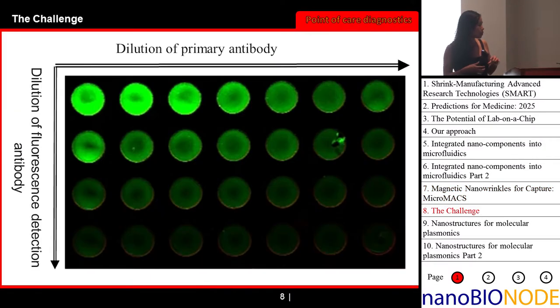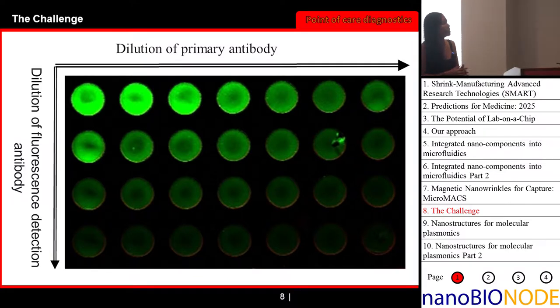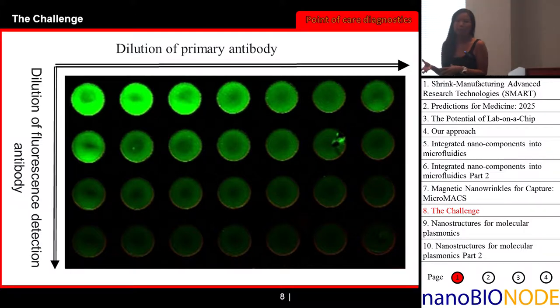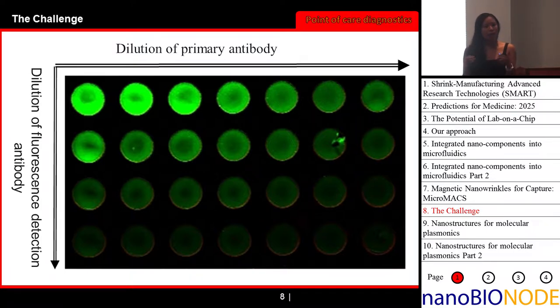The larger question that we've really been tackling over the last several years is, when you go out to the field, how do we bring the detection capabilities that we have in the laboratory to the field? This field of lab on a chip, my chair of my department, Professor Abley, who's also a lab on a chip person, says we call it lab on a chip, but right now it's more like chip in a lab. And it's really true.